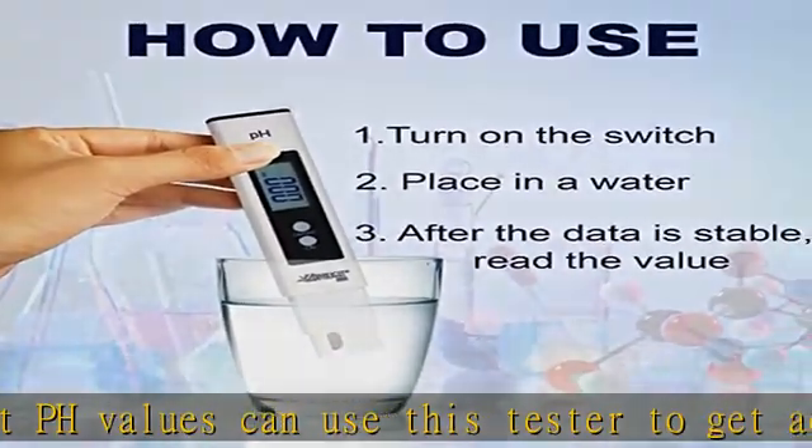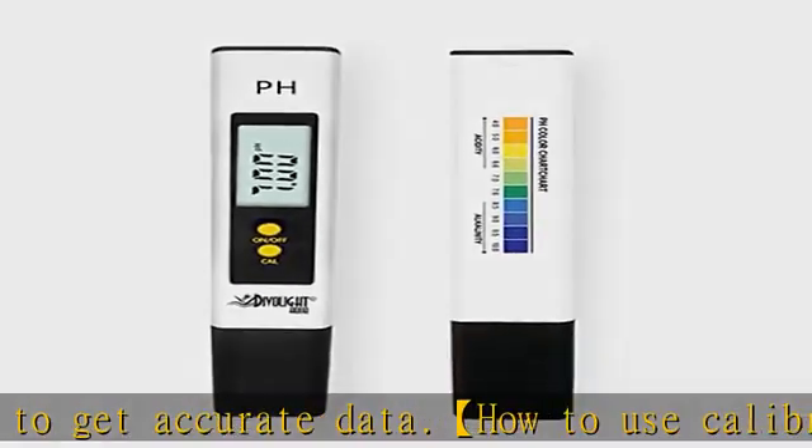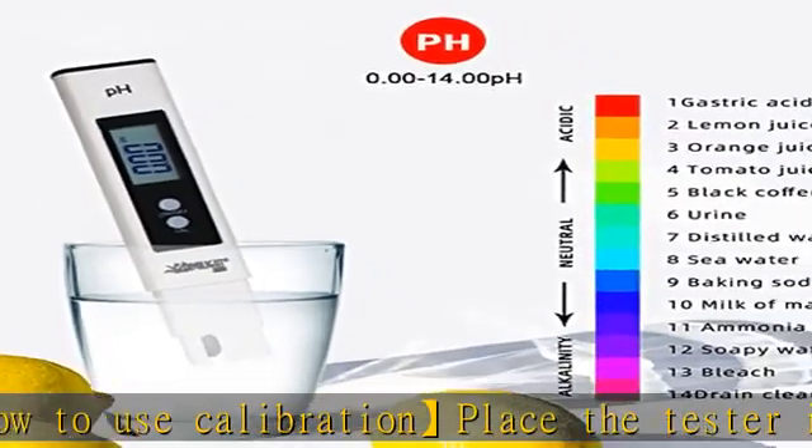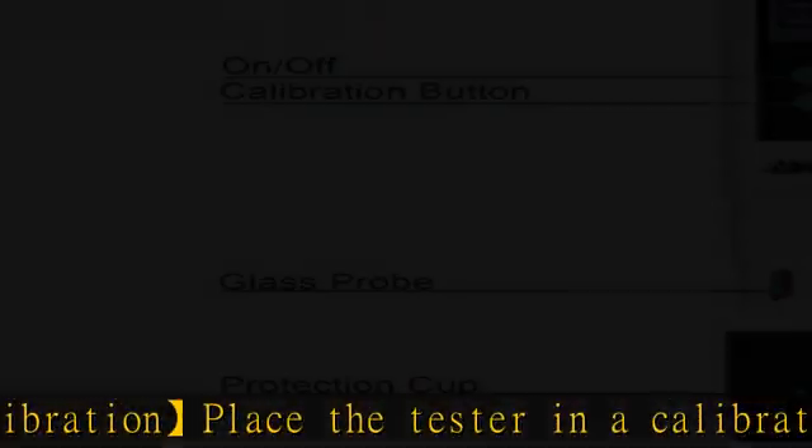Easy to use: turn on the switch, place the probe into the water and stir, making the small glass ball fully contact the liquid. The value can be read when the value is stable.